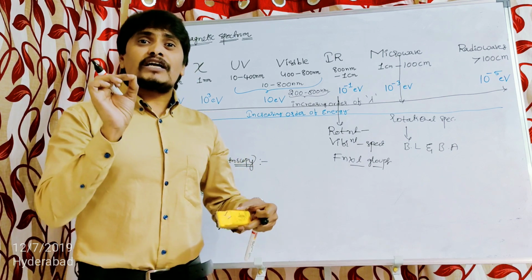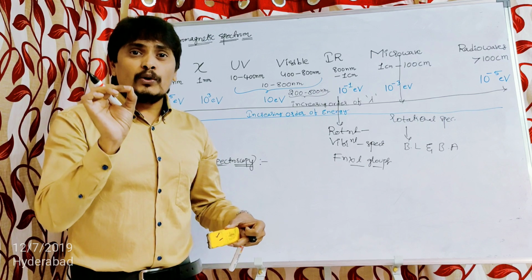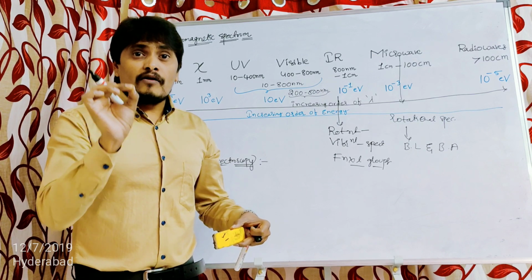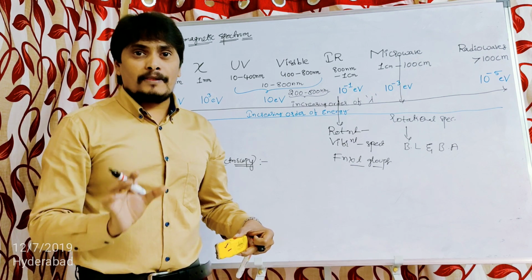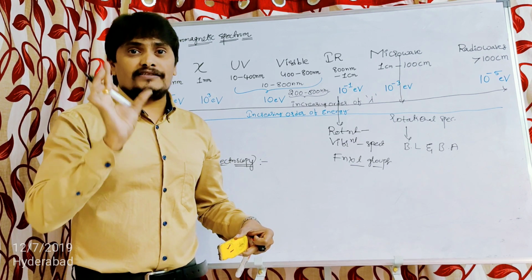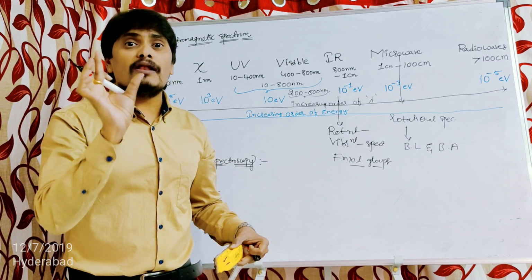So whenever we are talking about electronic transition, we have to talk about which electronic transitions precisely. What are those electronic transitions? Because not all electronic transitions are possible.